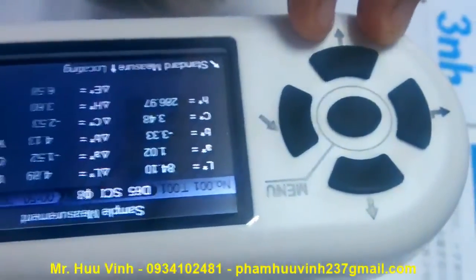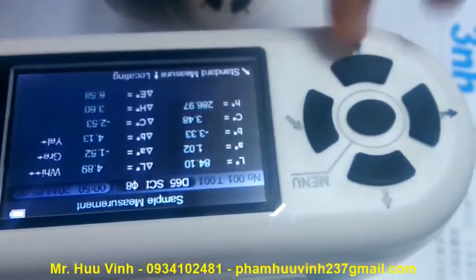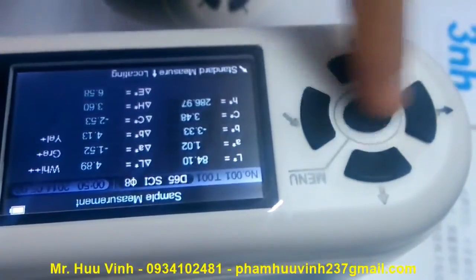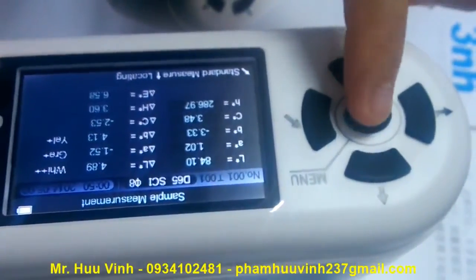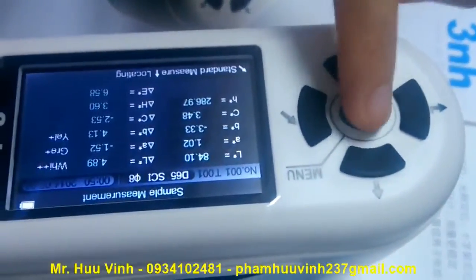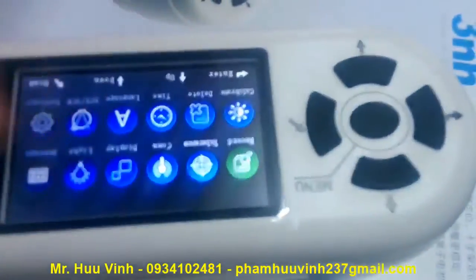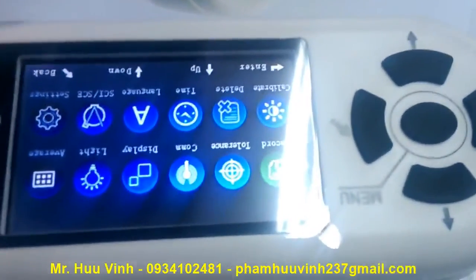If you want another function, please press this menu button here, and it will show all the functions.